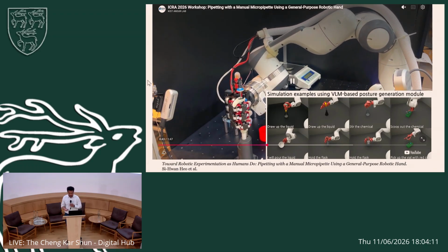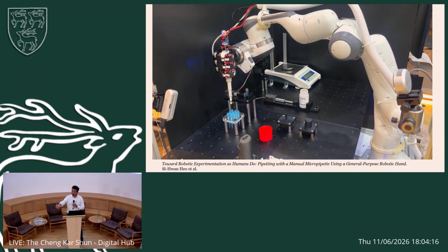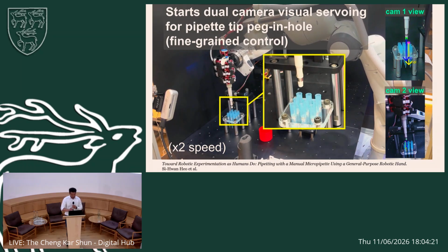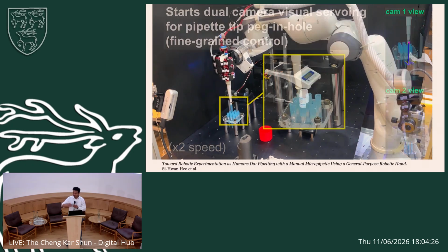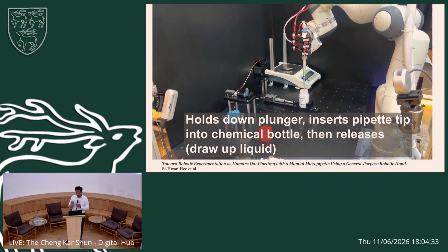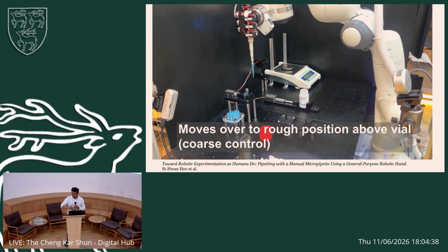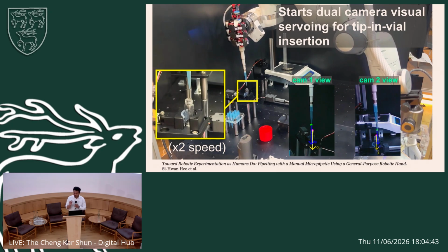And with the VLM, they're then able to generate a grasp pose, so basically just where the arm needs to be in order to achieve the task. And on top of that, in this fine motion of actually performing the pipetting, there's this visual feedback loop, where the model constantly detects where the pipette currently is versus where it needs to be, and that correction signal is what allows it to accomplish this task, because obviously from day to day, the exact locations of these pieces would move a bit, and the way of correcting that error is through this live feedback.